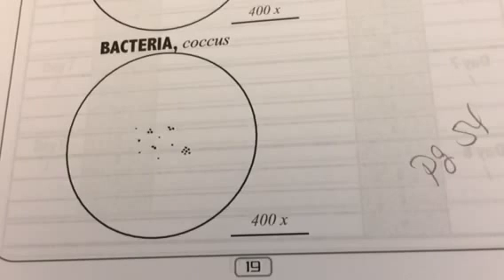Do you have any growth? What does it look like for all of the different quadrants of your culture dish? And then that goes on for 8 days. Please check it every day and record it in there. And then the 8th day, I think, will be next Tuesday. So you can just give me the results on Monday. And if I get any good pictures, I will put it out on the web for you to see.